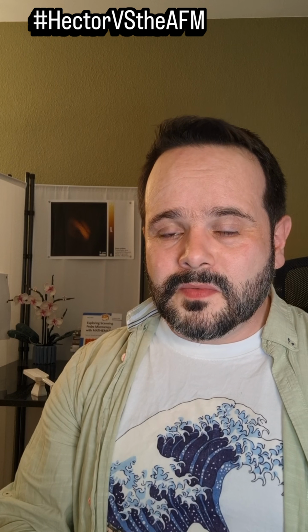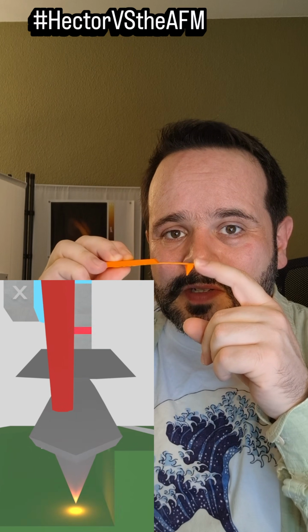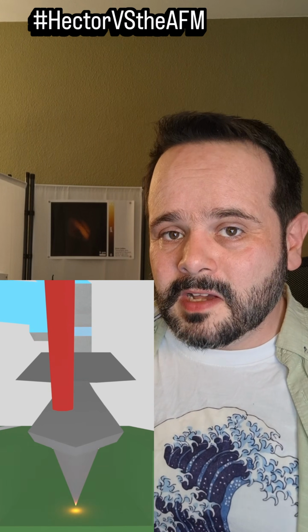This is dynamic force mode, also known as tapping mode. In this mode of operation, the AFM oscillates the probe close to the resonant frequency and scans the surface, keeping a constant amplitude reduction.